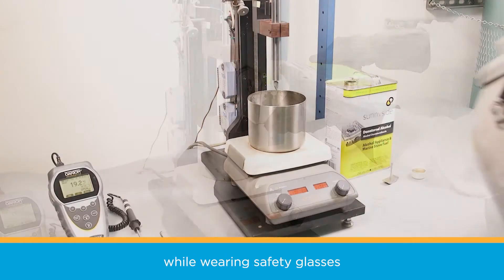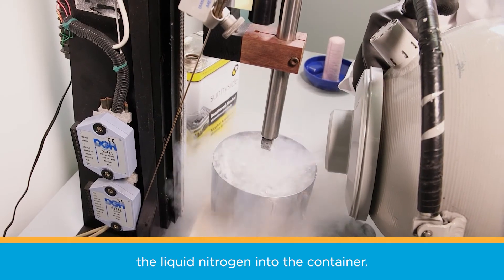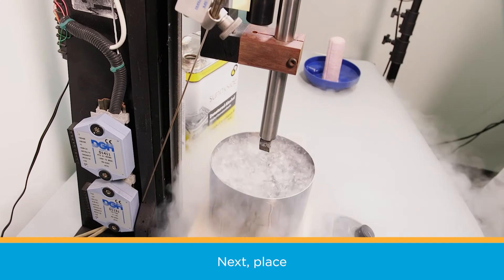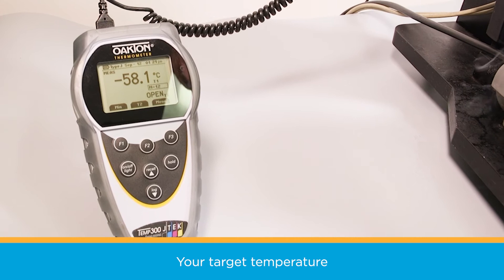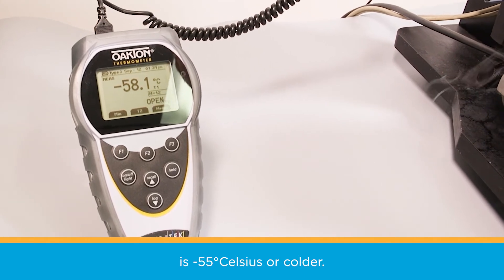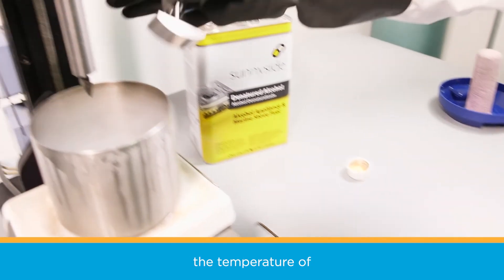Now comes the fun part. Wearing safety glasses and protective gloves, slowly pour liquid nitrogen into the container. Next, place the thermocouple into the dish to monitor the temperature of the alcohol. Your target temperature is minus 55 degrees Celsius or colder. Use a stir bar to ensure the temperature of the bath is consistent.